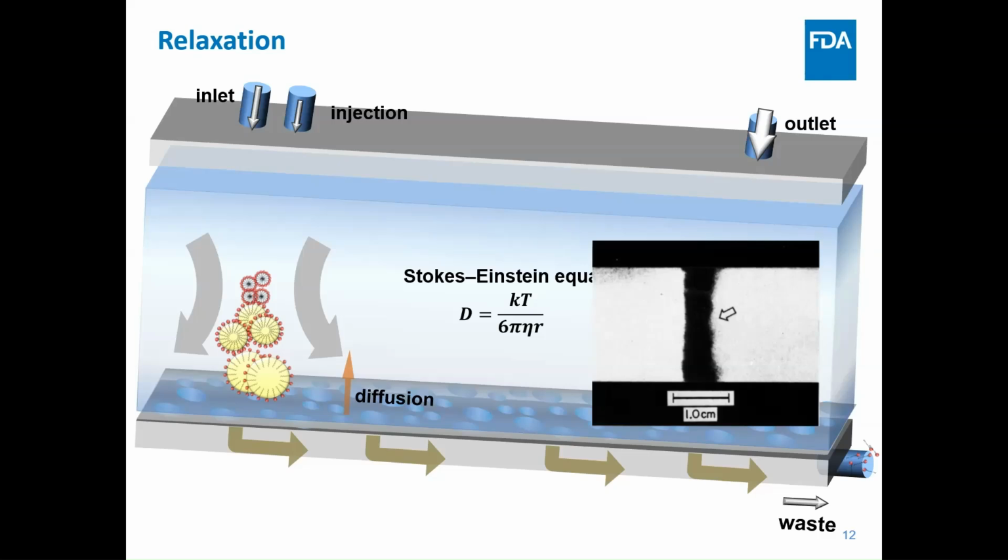If we have a very dilute sample and we inject a very large volume in the LC, we will get a very big peak dispersion. But in AF4, we can concentrate this dilute sample in a narrow band, and then let the elution start after the sample is concentrated.